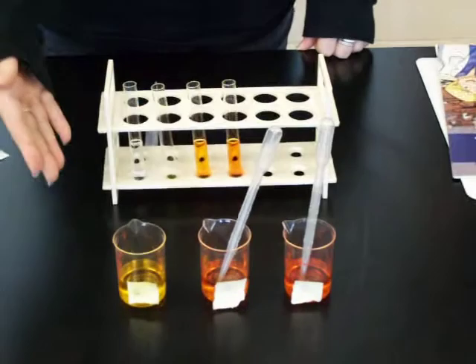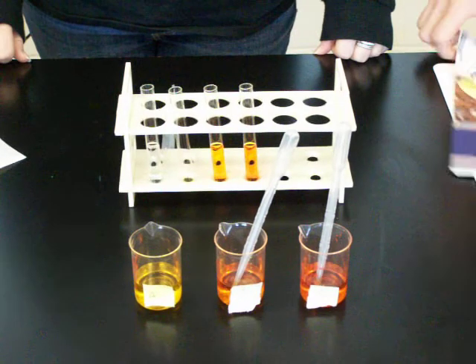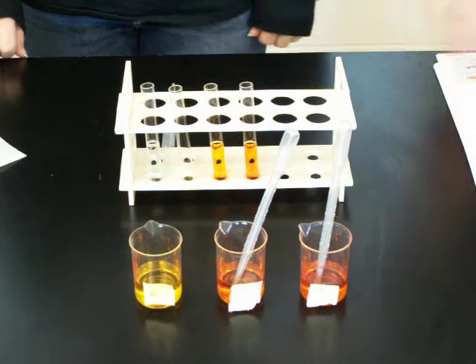Look at samples A, B, and C. Rank the samples based on color intensity from least intense to most intense and record in your workbook.